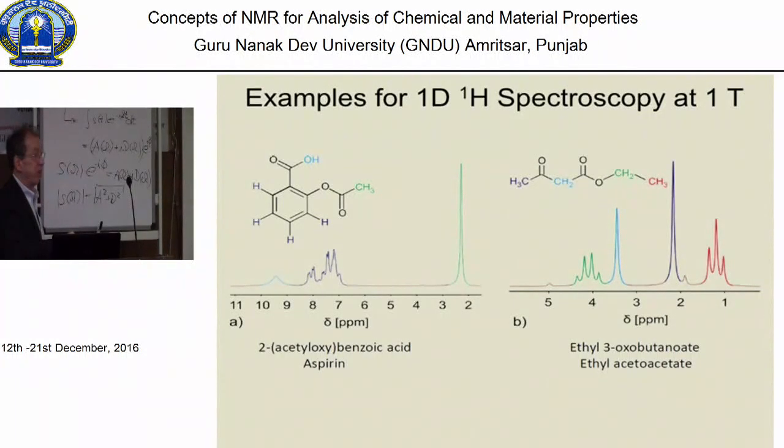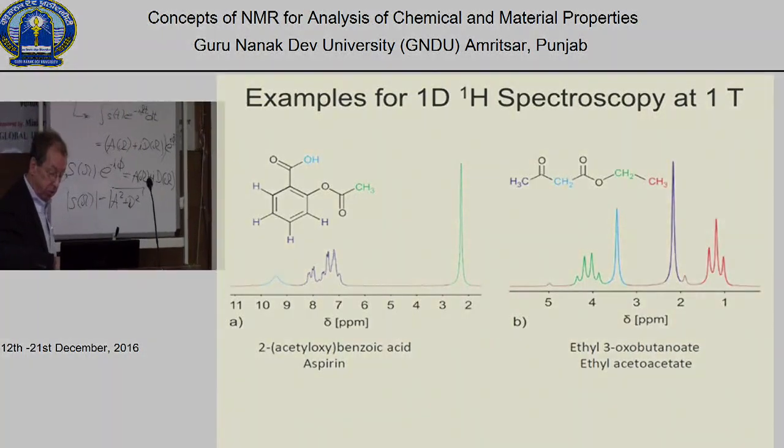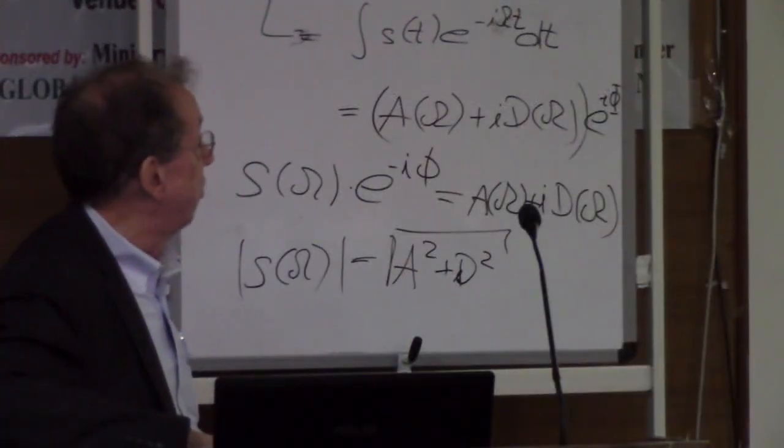But it's not always that easy. And because it's not so easy, then one has to go to multidimensional spectra. And that's another lecture when we do multidimensional NMR spectroscopy. But I have a few slides left.